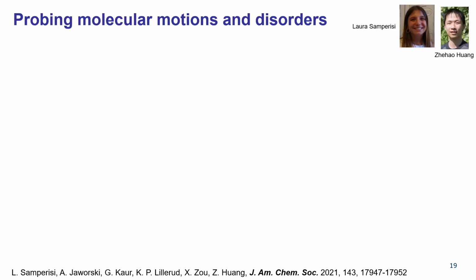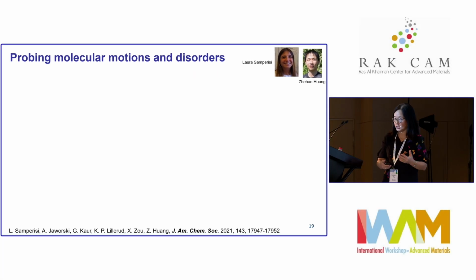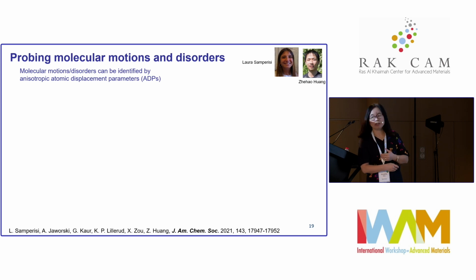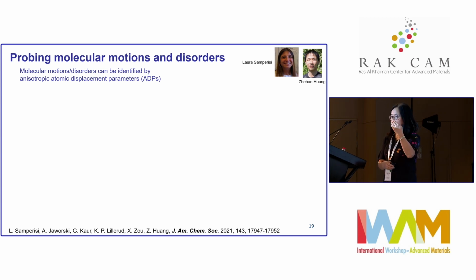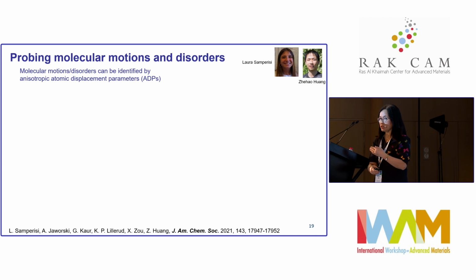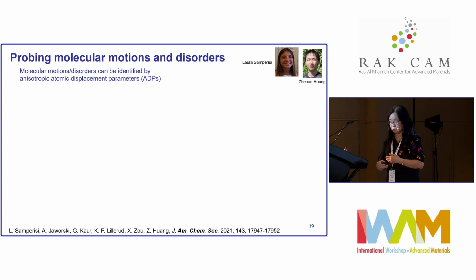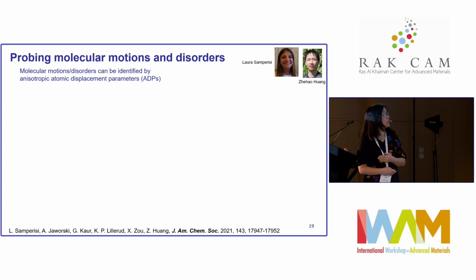And not only can we solve the structures, but when you have very good data, we can also study the motions and molecular disorders in the structure, in the same way as single crystal X-ray diffraction. What we look at is the anisotropic atomic displacement parameters to see how it behaves.